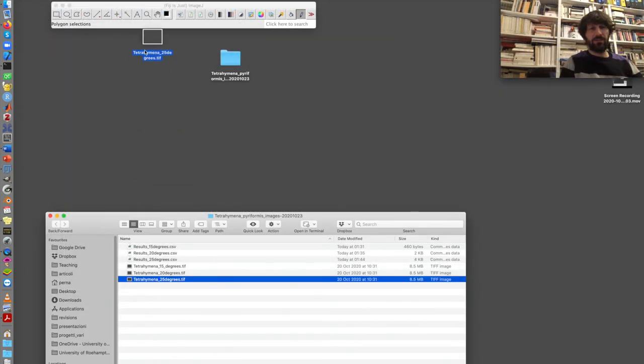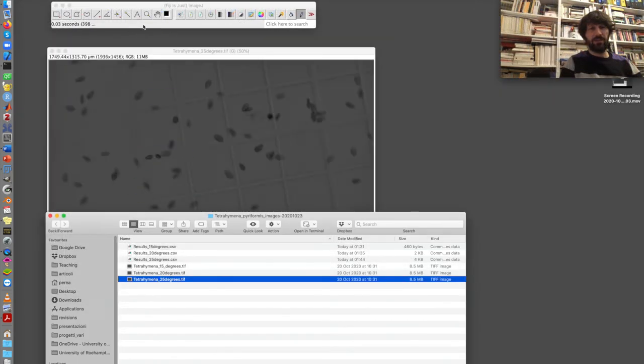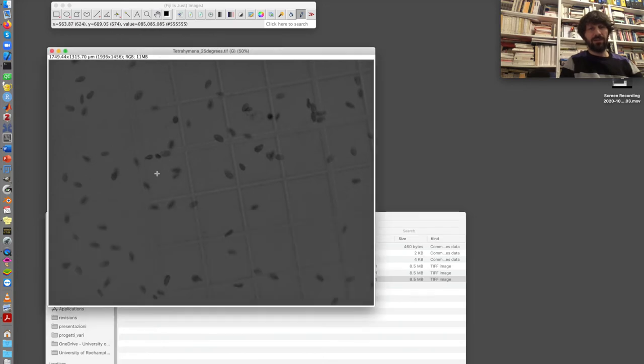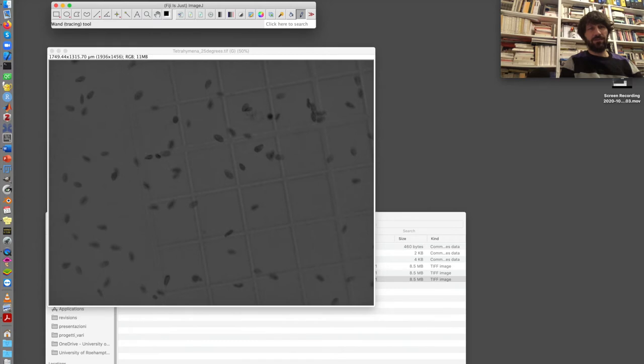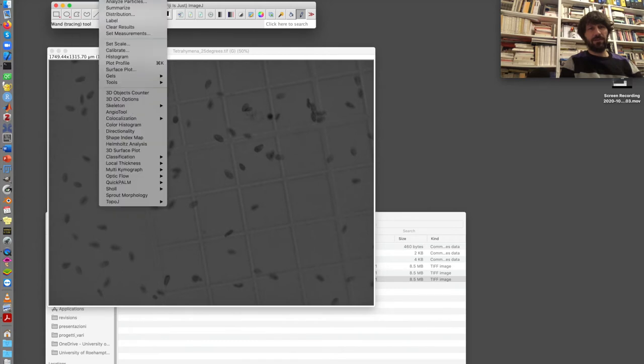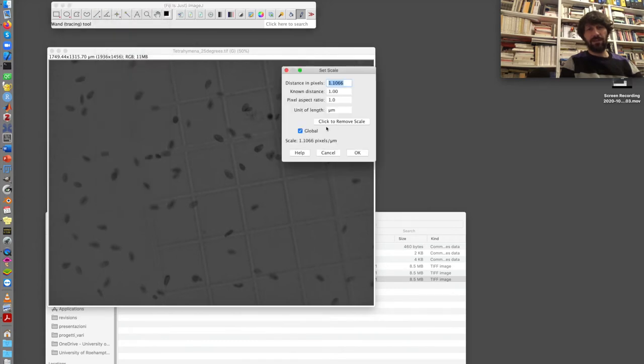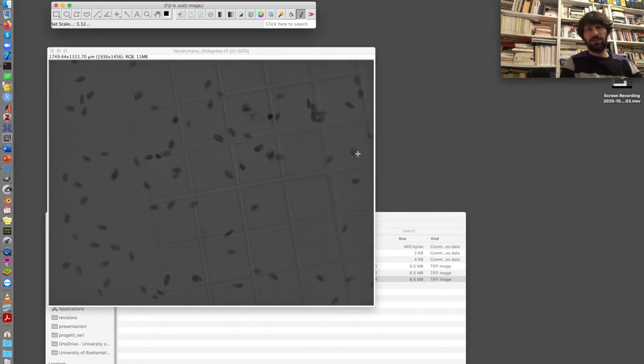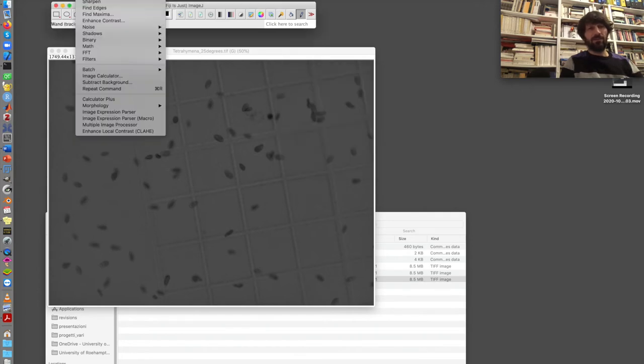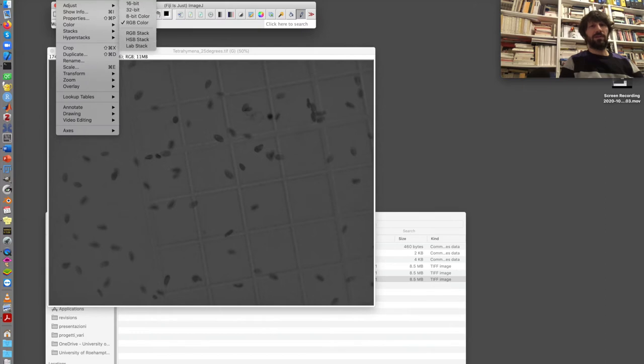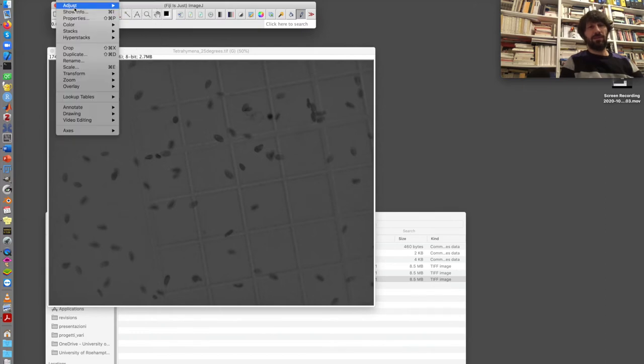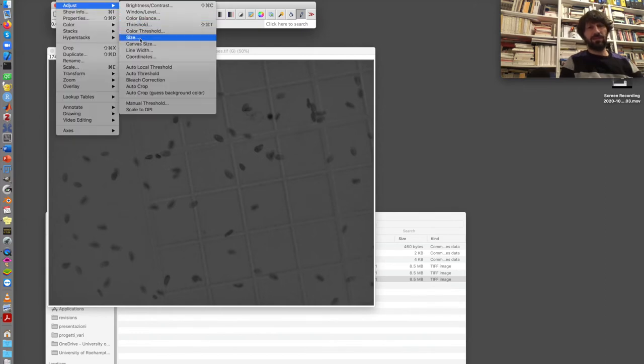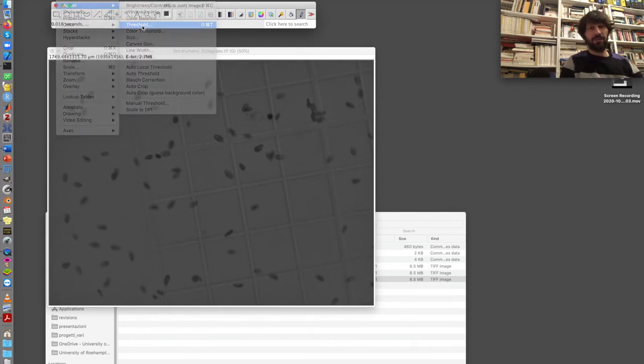And now I analyze the third image, the image of cells adapted at 25 degrees. This image is a little bit more difficult, because there are many cells, some overlapping, and some that are a little bit blurred. Let's see how it goes. So I check that the scale is the same as the previous images. And then I go to image type, 8-bit, image adjust, threshold.